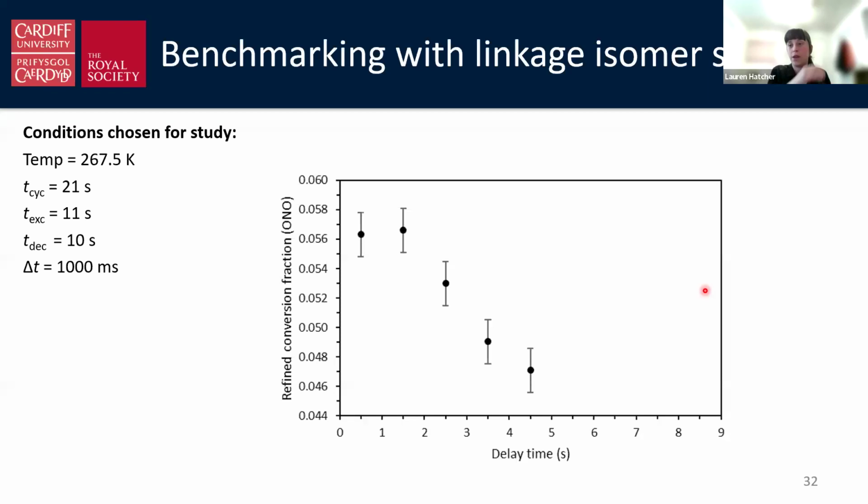So we start off with some excitation up here, and we immediately see it decay as we go forward in time, which is really nice. These error bars are a standard deviation that I took from doing a dark state run with the same crystal with just the X-rays, and where we saw essentially no change, and I just generated standard deviations from that. So we can see decay, so that's really exciting. That's comparable to the synchrotron.